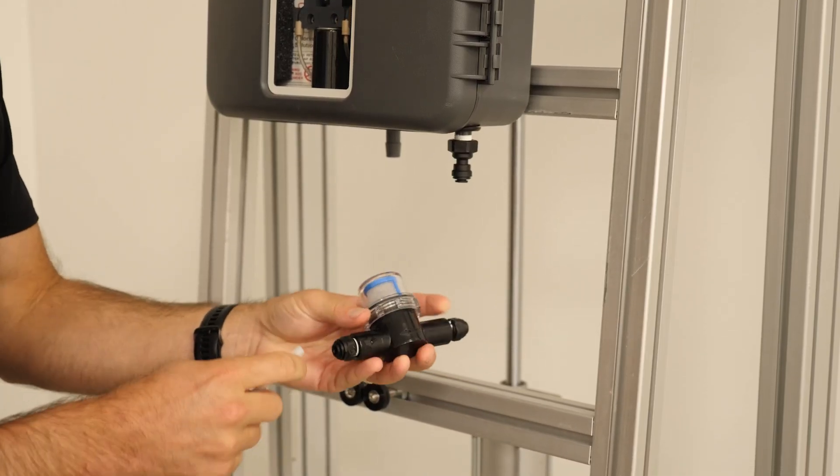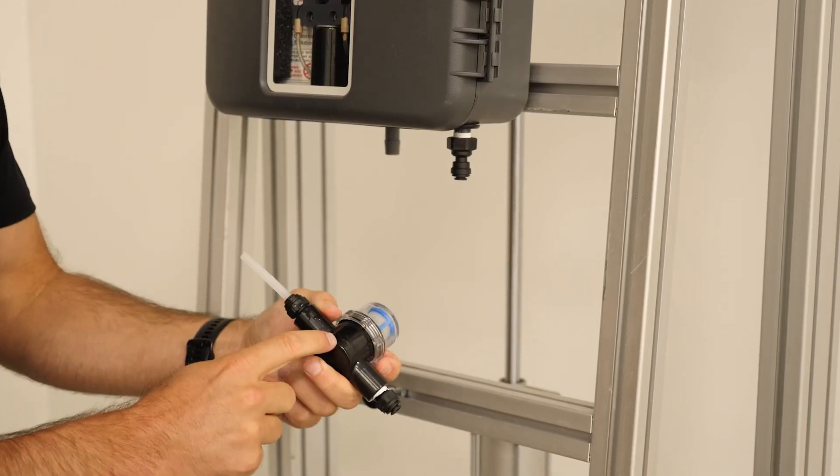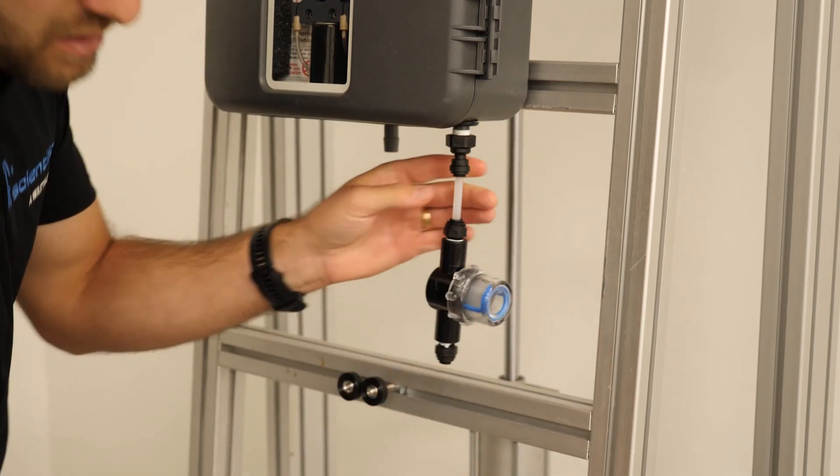We will begin by putting the T-strainer on the inlet quick connect to the analyzer, making sure to have the arrow pointing in the flow direction.